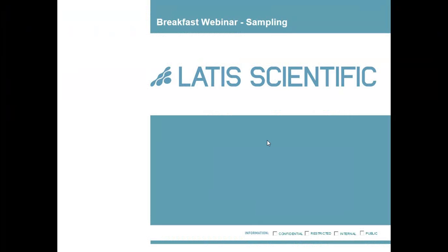This morning's webinar will be talking about sampling and making sure we're taking the right result, or maybe better described as getting a meaningful result.